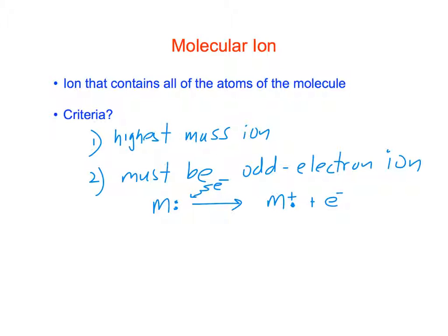Can we do it the other way where we get a negative M with an extra electron? There are methods to look at negative ions. Usually, if you send mass spec samples off and they don't have the exact mass that you predicted from the positive ion spectra, they'll use different techniques. What would you have to do to look at anions? You'd have to flip the plates. Right, you have to flip those plates.